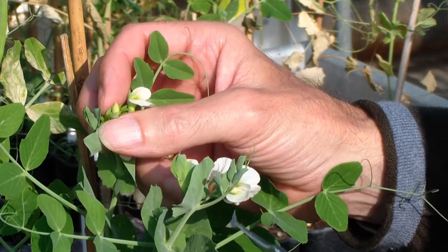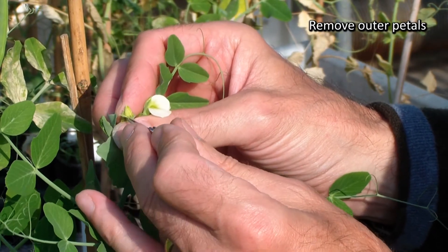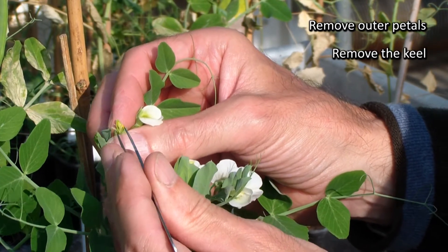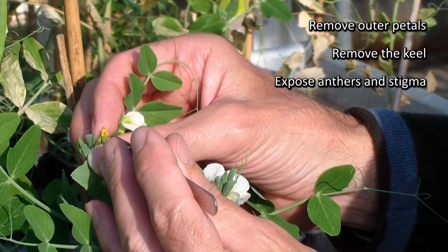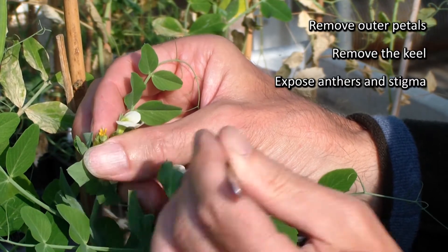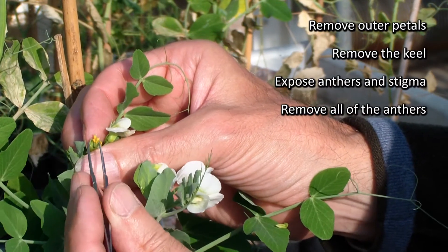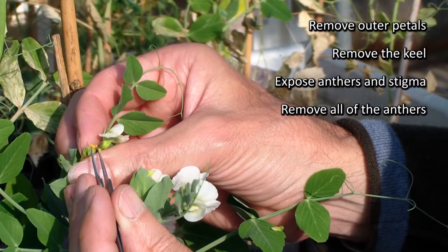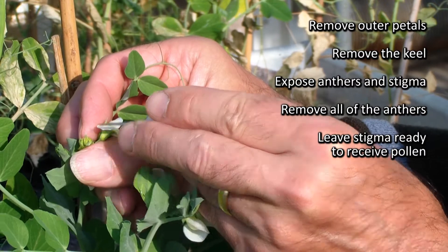What you do is go in with the tweezers and carefully remove the petals, starting with the outer petals and then going in and removing the keel. This clearly exposes the anthers and the style — the heart of the flower. Carefully take off the anthers and remove them all.